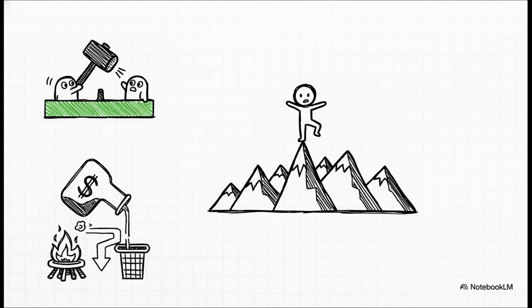And believe me, it gets worse. OFAT locks you into that whack-a-mole game, right? You're just fixing symptoms, not actually learning what drives your assay. It leads you to find these tiny, narrow sweet spots that look amazing on one perfect Tuesday, but then they completely fall apart the second you get a new lot of plates or someone else runs the protocol. You end up burning through expensive reagents, chasing things that probably don't even matter that much.